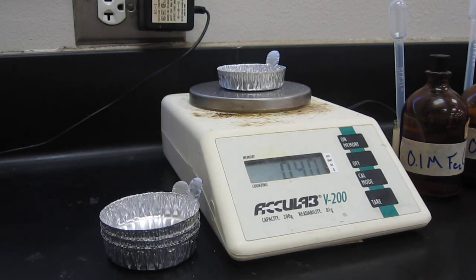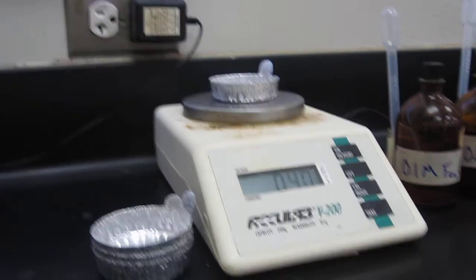As you can see, the balance is now indicating a mass of 0.4 grams.